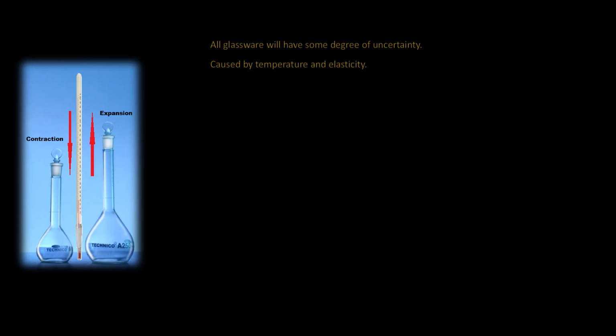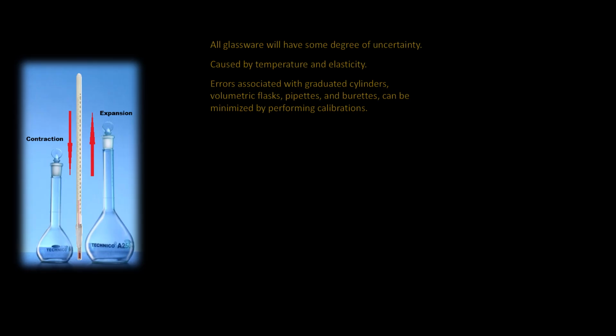In addition to this, manufacturing processes will not produce an exact copy of each container. There will be some slight differences. Although microscopic, all will contribute to systematic errors. These are all unavoidable. Errors, however, can be minimized by performing calibration techniques.